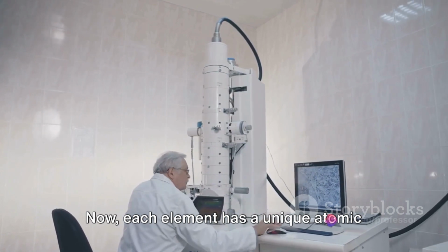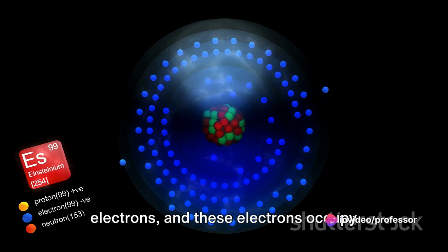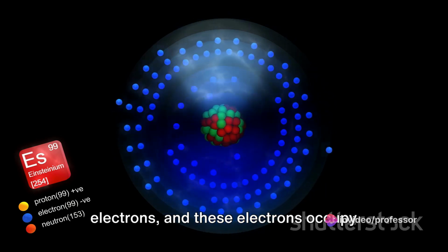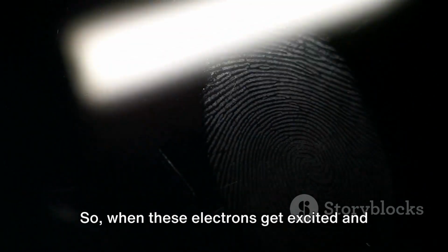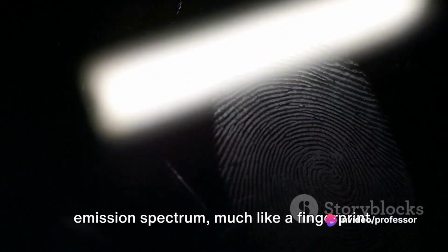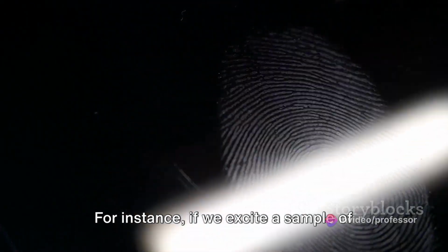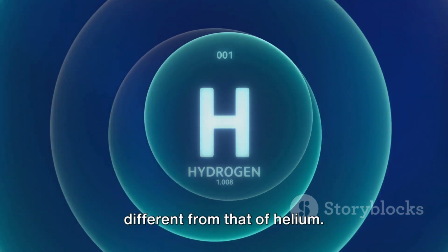Now, each element has a unique atomic structure with a different number of electrons. And these electrons occupy distinct energy levels. So when these electrons get excited and subsequently relax, they emit light at specific wavelengths. This gives each element a unique atomic emission spectrum, much like a fingerprint. For instance, if we excite a sample of hydrogen, the light it emits will be different from that of helium.